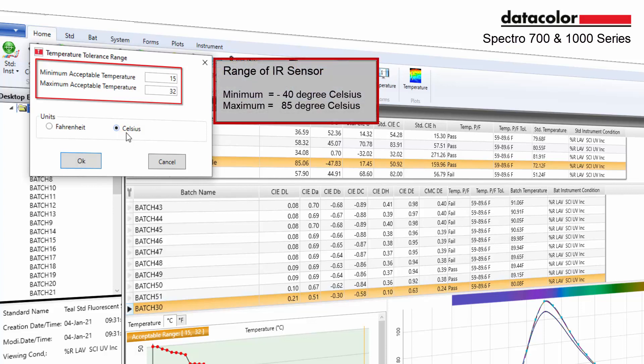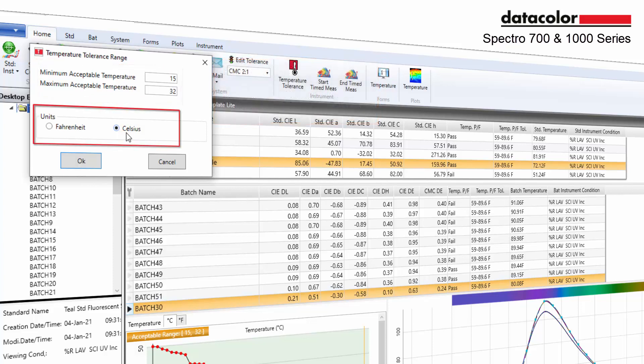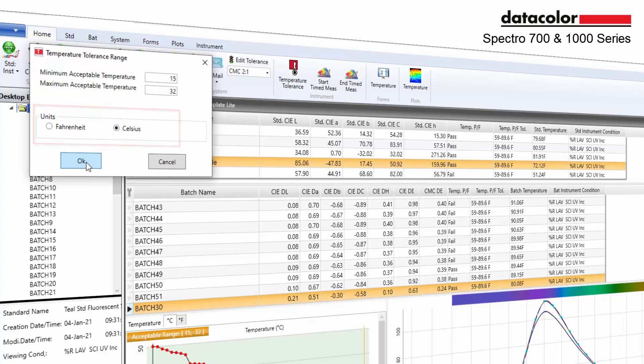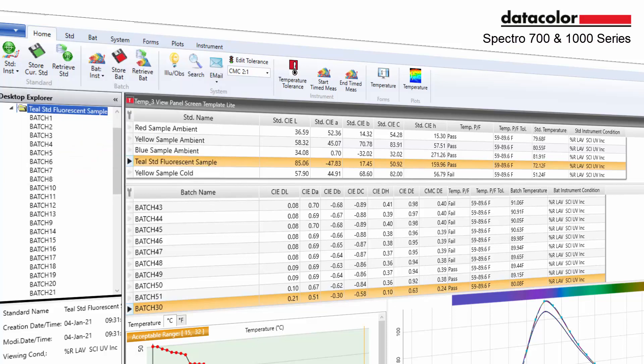This range can be adjusted within the range of the IR sensor with a minimum acceptable negative 40 degrees to a maximum 85 degrees Celsius. This option also enables users the ability to choose the desired temperature units, Fahrenheit or Celsius, that will be displayed on the grid.